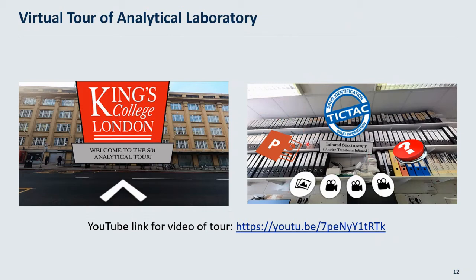And here you can see that this is a video of the PowerPoint. This is a zoomed in picture of the instrument itself, and these video series here are of a colleague of ours at St George's actually conducting the analysis of the FTIR, of an unknown substance.